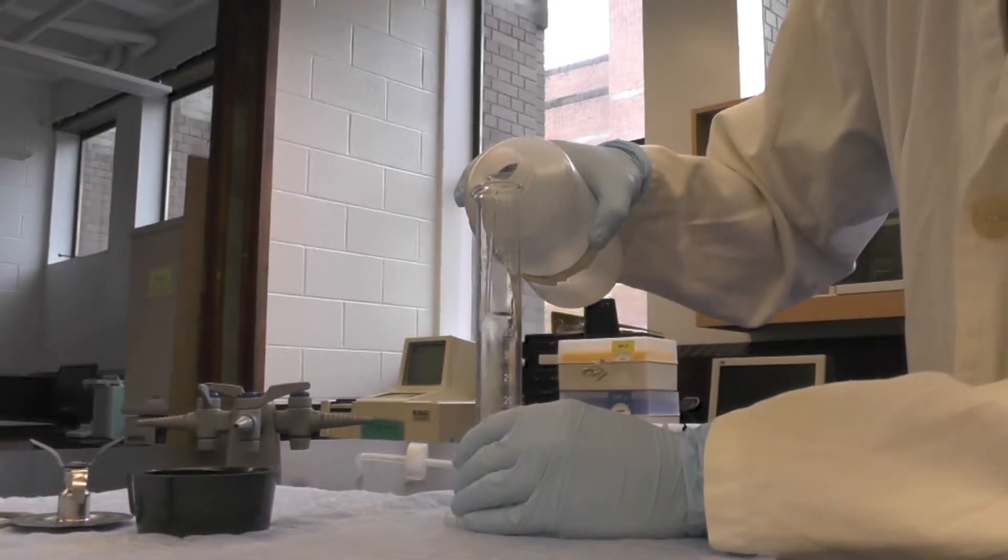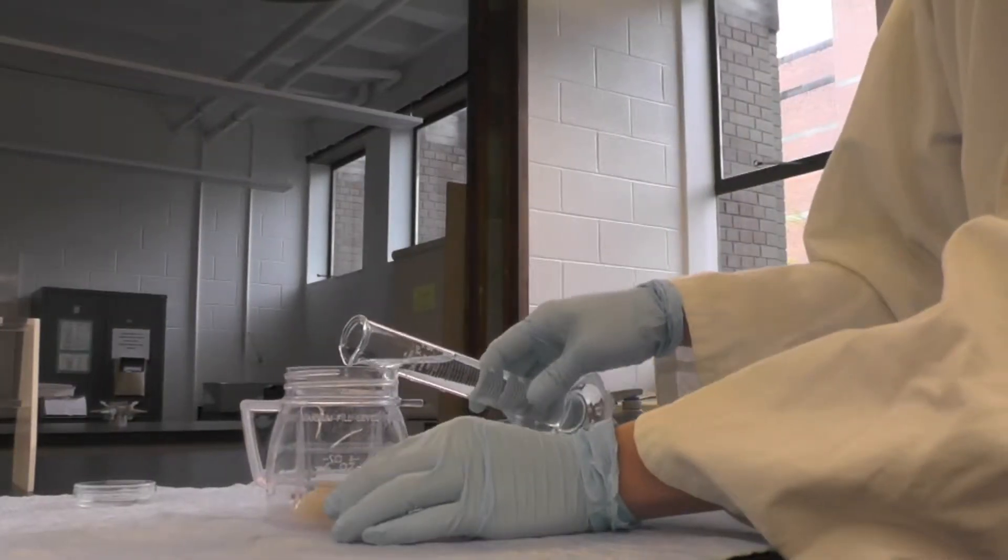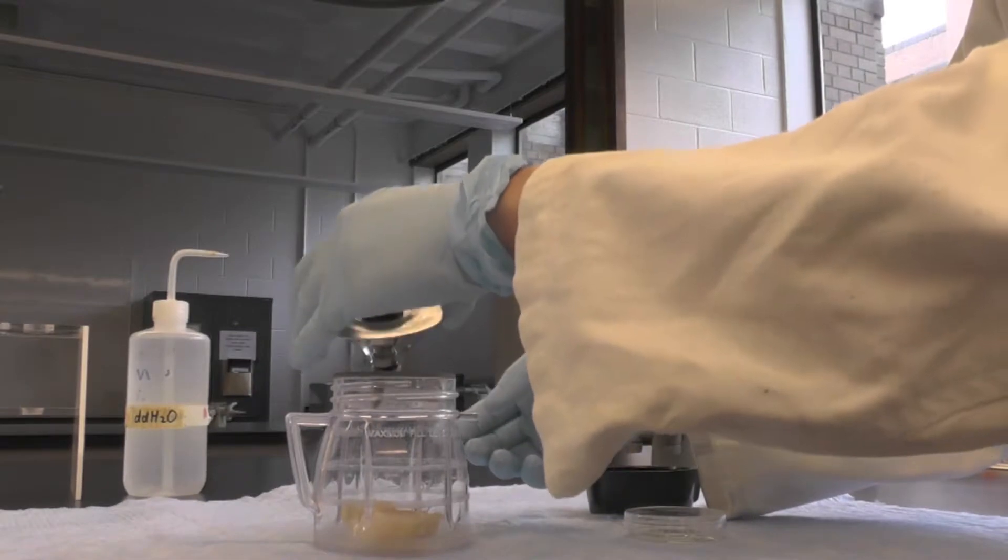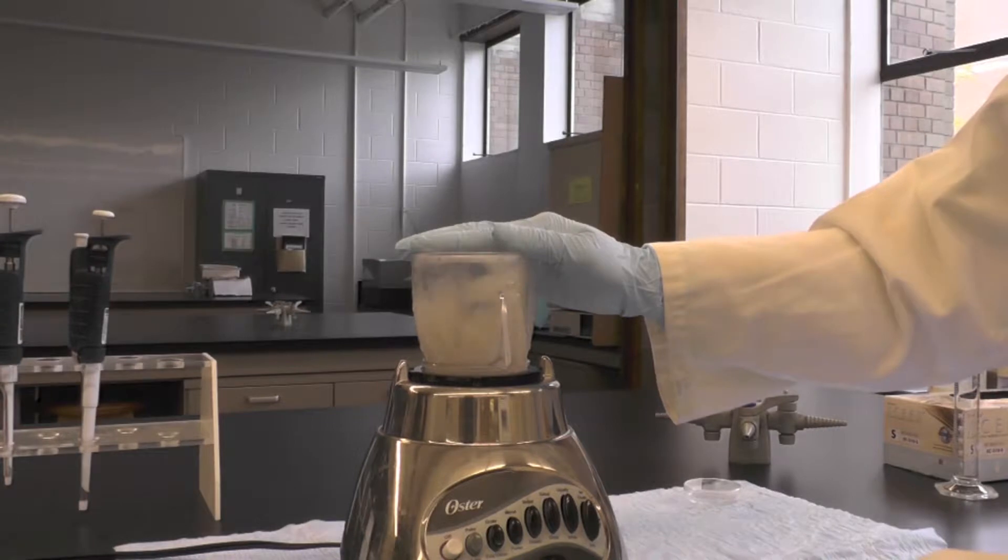Then, using a graduated cylinder, add 50 mL of DD water. Homogenize the sample for about 1 minute until it's well blended.